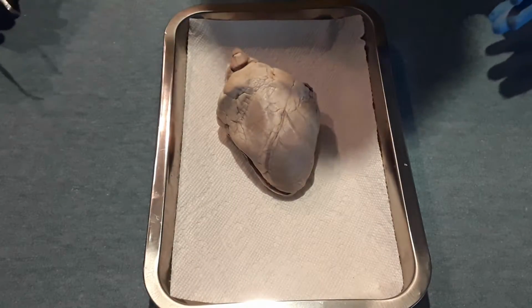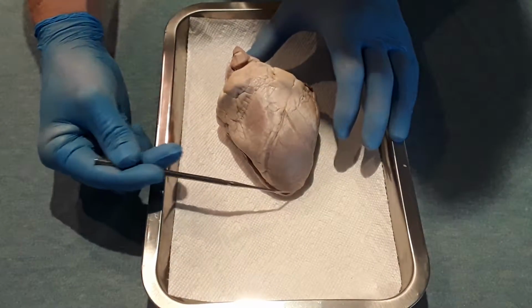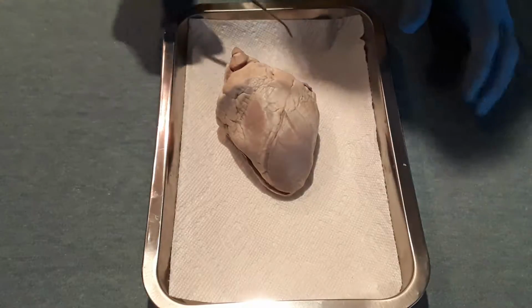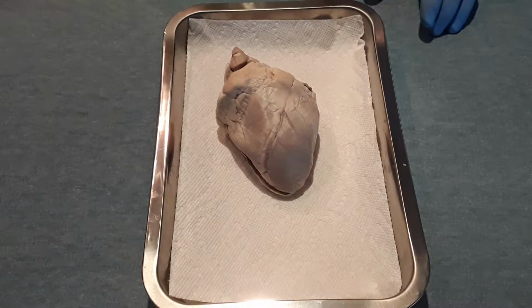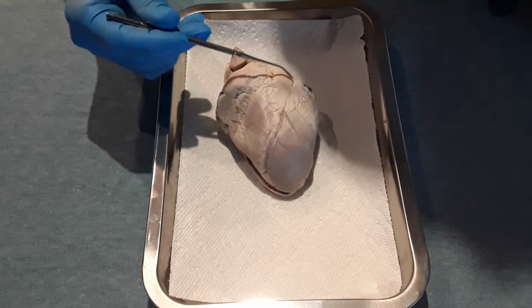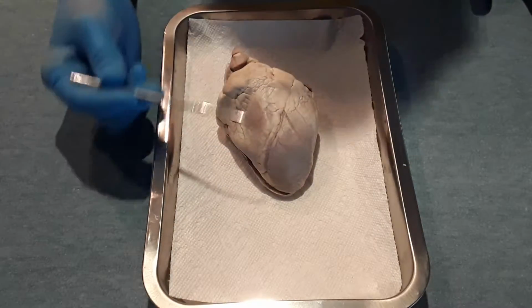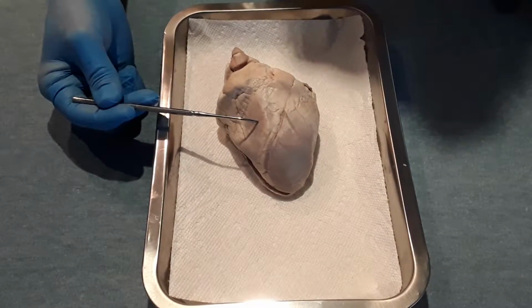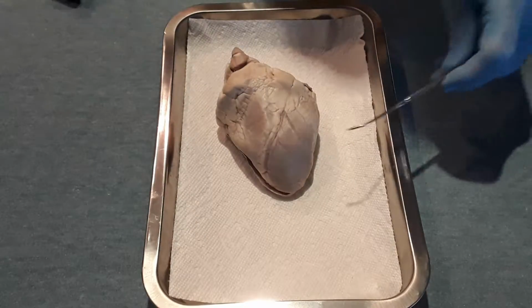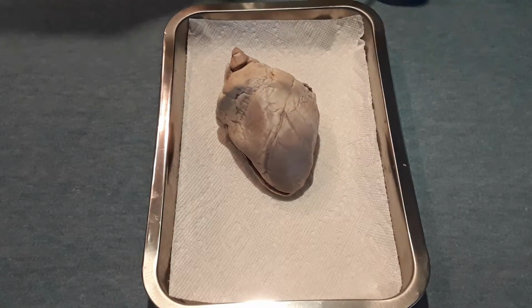We'll start with some of the anatomical terms here. This is the apex of the heart at the bottom. The top part of the heart is actually called the base of the heart. This line you see here is a blood vessel. It is called the interventricular sulcus. It divides the right ventricle on this side of the sulcus from the left ventricle, a much larger area on the left side of the sulcus.